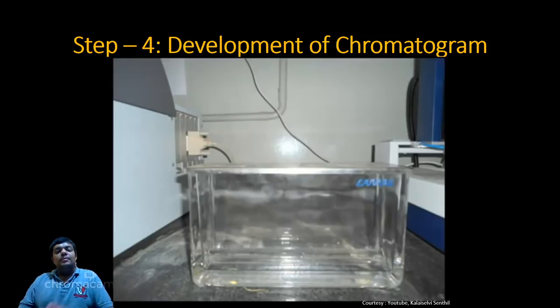After that, you will be placing the TLC plate. It will be filled with 10 to 15 ml of solvent, that is stationary phase, in the ratio of 5:5:1 of toluene, ethyl acetate and formic acid. Over here, the speaker has made a mistake. She just now spoke that 5 is to 5 is to 1 ratio of stationary phase. It is not stationary phase, it is mobile phase. But do not worry, we are today focusing more on the instrumentation.